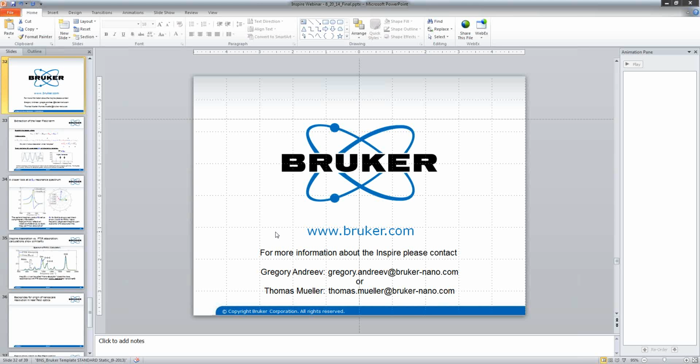And it helps if the tip has a visible apex. This greatly increases the amount of scattered light that the optics can collect from the tip. If the tip does not have a visible apex, then there tends to be an overhang which blocks some of the light from the tip. So those are the only two necessary requirements: a durable metallic coated tip that has a visible apex.